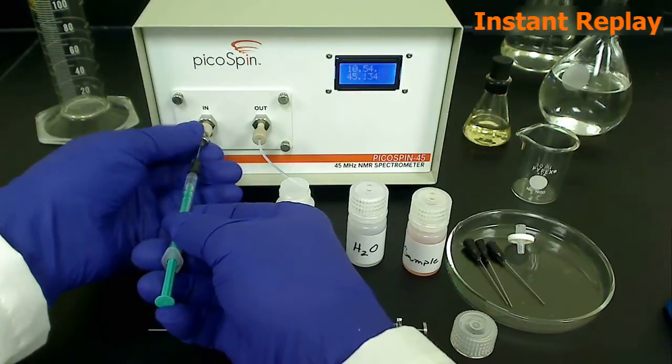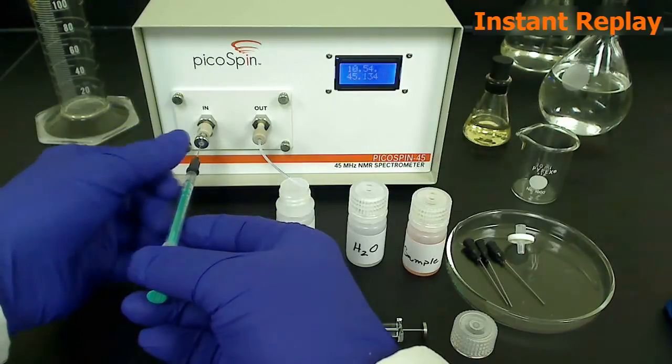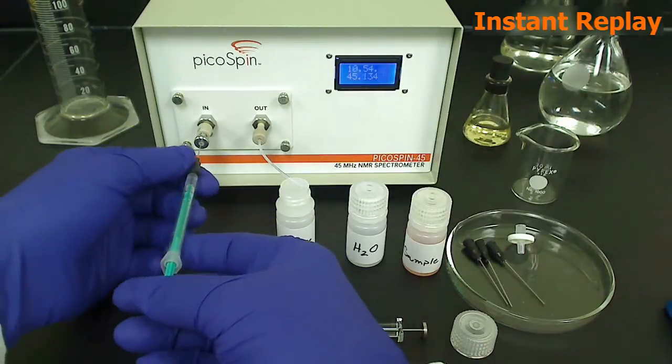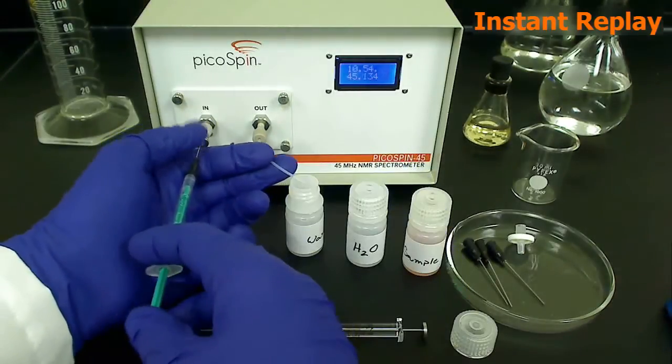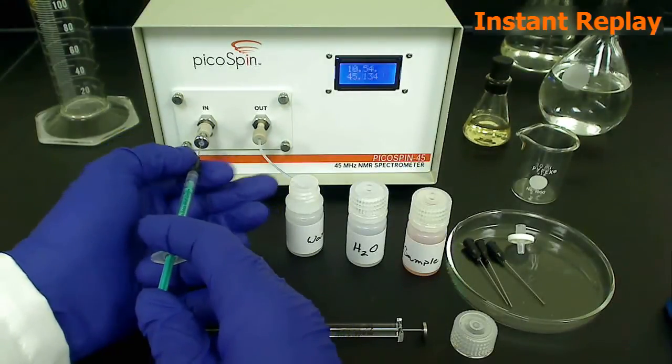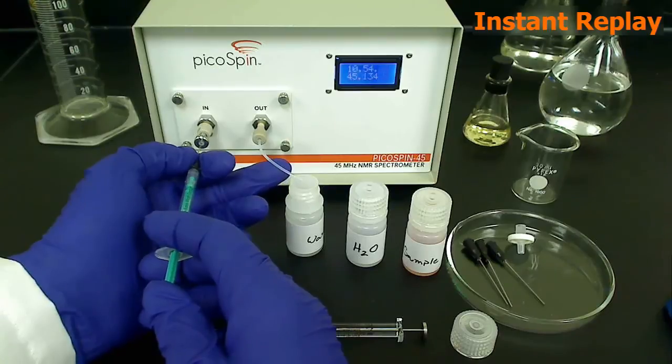To completely displace the sample resident in the cartridge, one needs to inject approximately 25 microliters of sample. This amounts to approximately 3 to 4 droplets being formed at the exit of the drain tube. You can inject as much sample as you like, so long as at least 3 to 4 droplets have been formed.